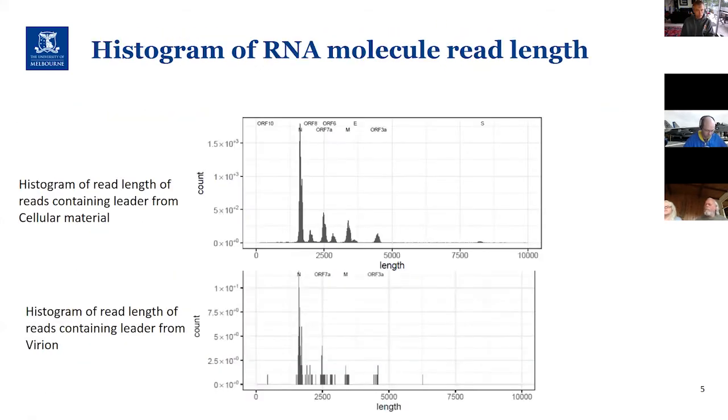So this length-based clustering into subgenomes is kind of okay, but it obviously falls short if you have things which are quite close in length together. It's quite hard to cluster a histogram, or reads which are forming the histogram, into the different clusters.